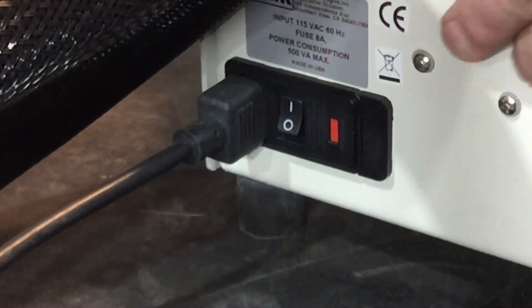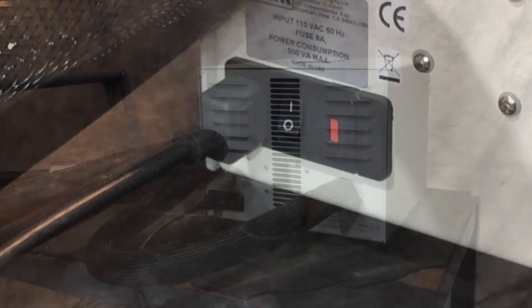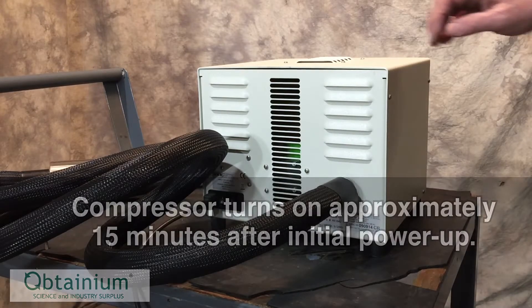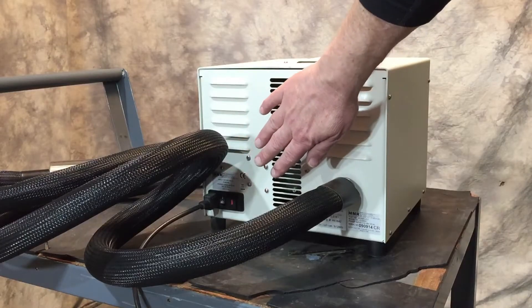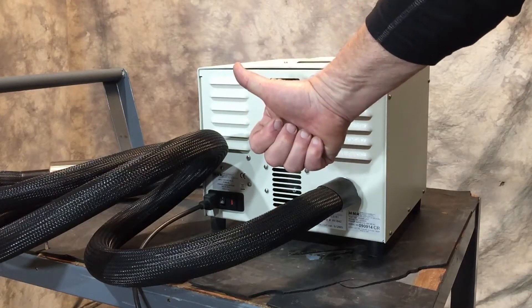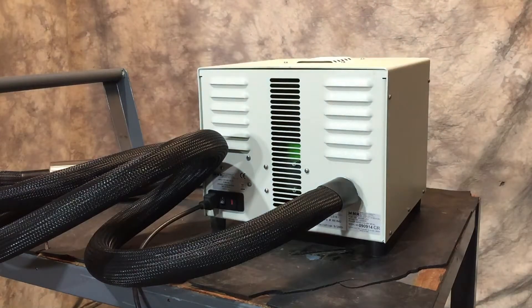The unit is powered up, and this is normal — the compressor kicks on within approximately 15 minutes. The compressor sounds smooth and uniform as it should, and the warm air exiting the back of the compressor tells you that the heat exchanger is doing its job.